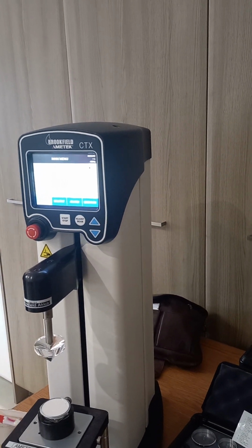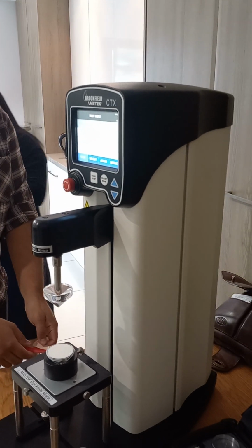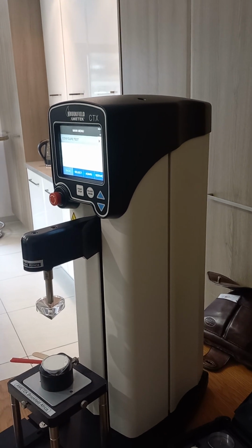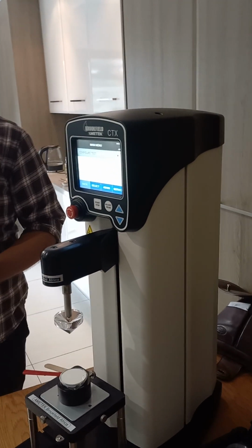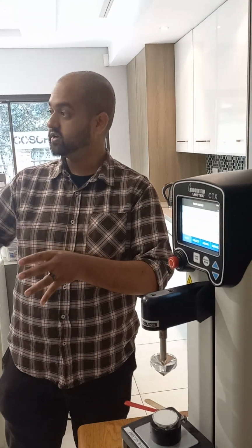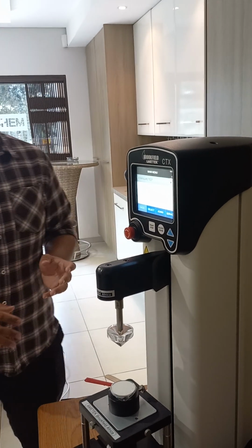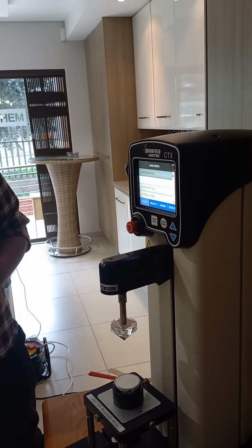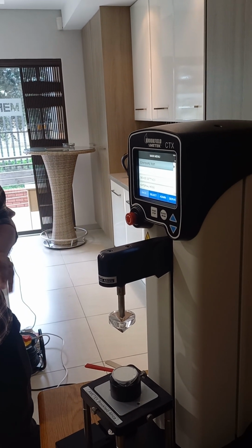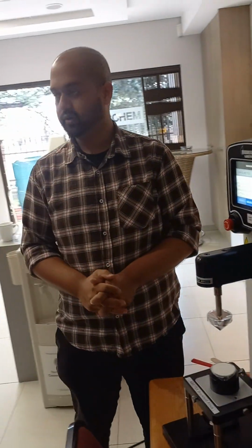So you can use the machine in either standalone mode or you can use it with software. The advantage of software is that there's more possibility of data analysis. You can analyze your force curves at every point of measurement. With standalone, you can still have a look at the curve, but you're just going to look for that specific number. So more for QC, standalone; if you're going to do more R&D, go to software.